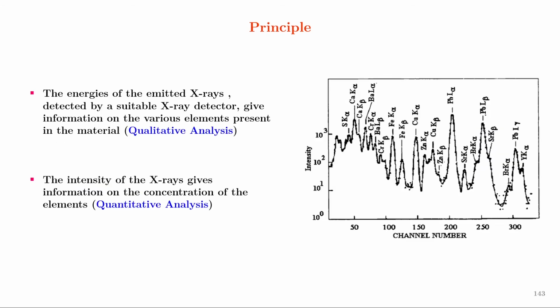The energies of the emitted X-rays detected by a suitable X-ray detector give information on the various elements present in the material, and this forms the qualitative analysis. The intensity of the X-rays gives information on the concentration of the elements, and this forms the quantitative analysis.